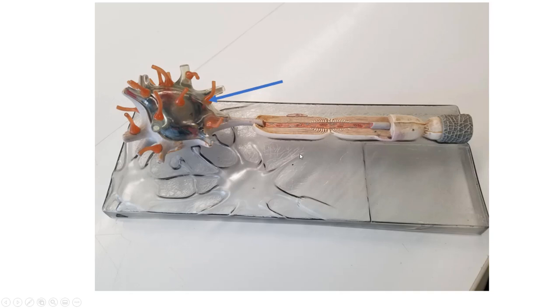The gaps between the Schwann cells would be the nodes of Ranvier. The connective tissue covering the myelin would be the endoneurium. Coming back here, here's your axon hillock where the axon meets the cell body.